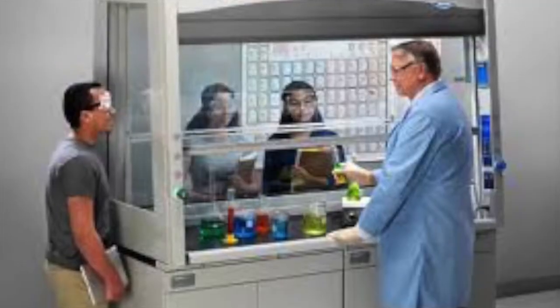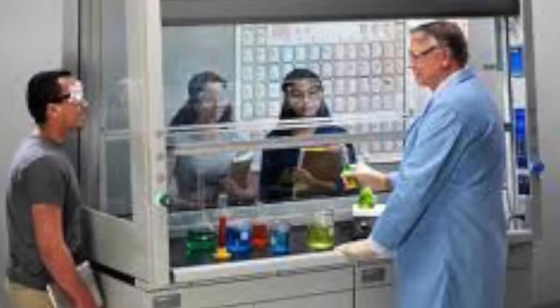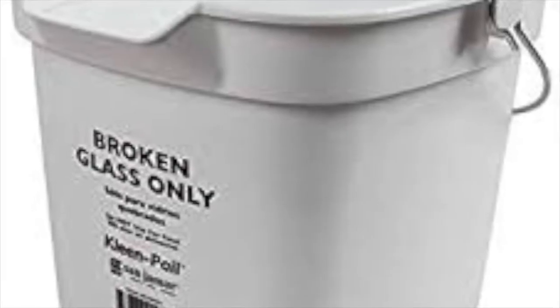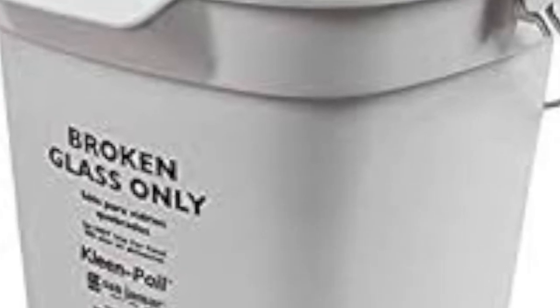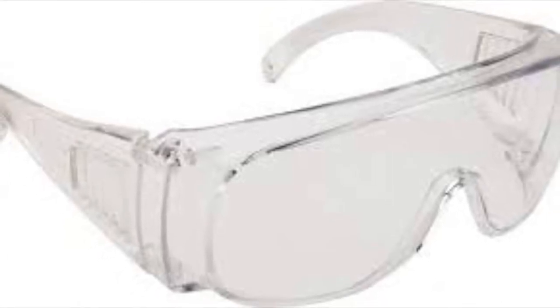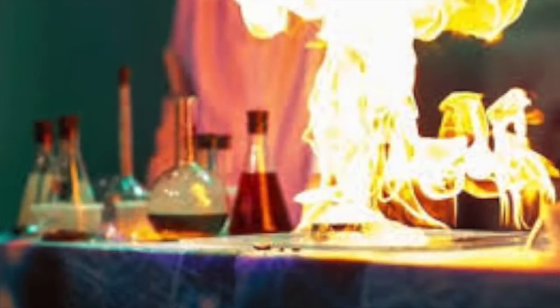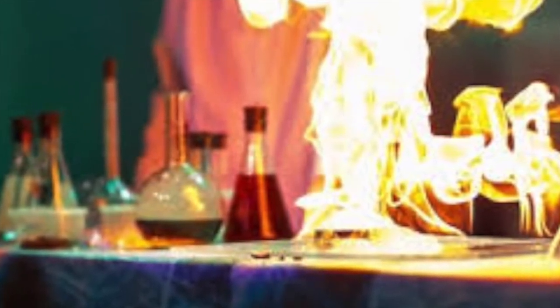A fume hood removes fumes from the gas that are potentially dangerous. A broken glass container stores broken glass, and you should sweep it up and put it into the bucket immediately. And safety glasses are used in order to protect your eyes before something bad happens. Know how to identify how things are dangerous, how dangerous they are, and how to take them out. But let's do some examples.